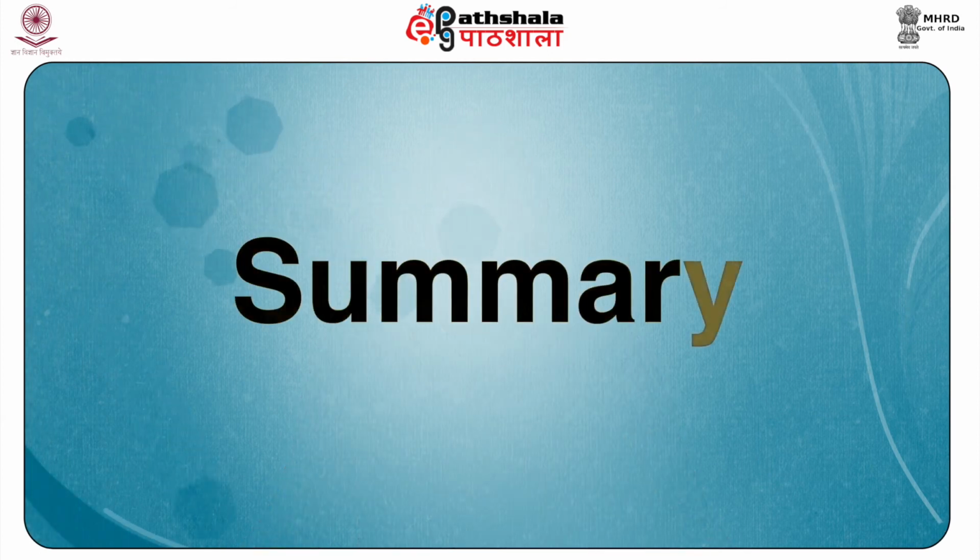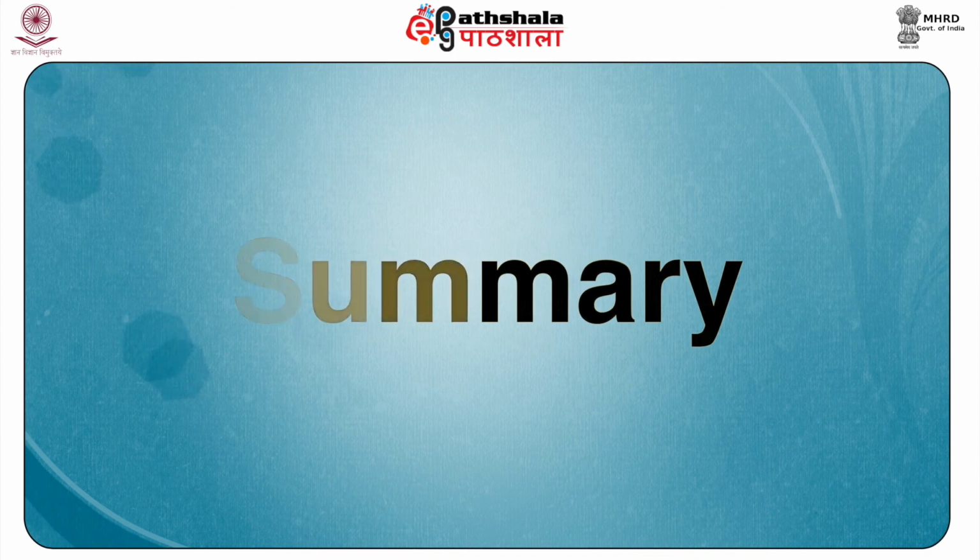So dear students, let us summarize what we have learnt in this module. We have learnt how the extraction or distillation of exhibits or samples is done with the help of diethyl ether, and recall you have to do it 2 to 3 times, and then collect these samples and concentrate them, and that is how you will be able to use this sample further for the chromatographic techniques. The chromatographic techniques we have explained in this module are the GC and the capillary GC.